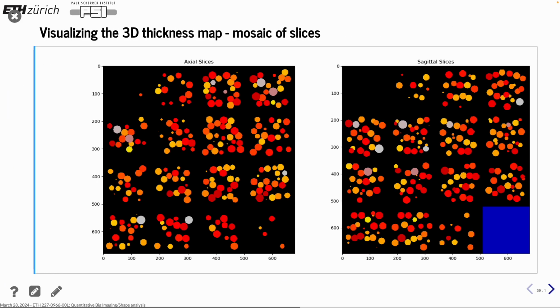Yet another way to look at it is to just take all the slices again through the bubbles. And here you can also see when you pass through the stack. So this is the top, and then it goes down, deeper down, all the way to the end. And same thing for the bubble from the side view.